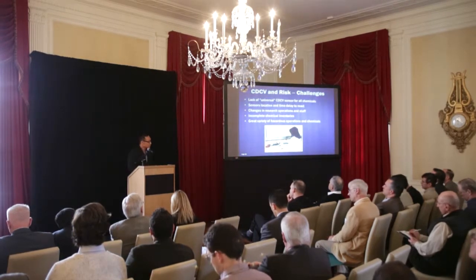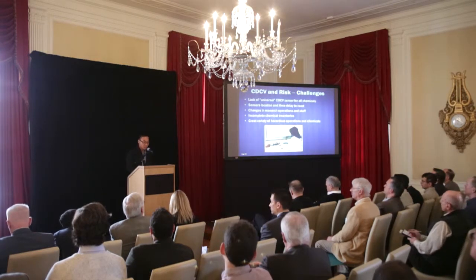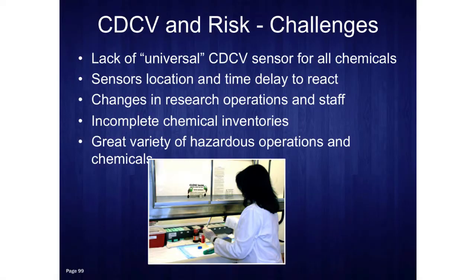So I think it's good to actually acknowledge what some of these shortcomings are. You know, a CDCV system is not a simple, you install it and everything in your lab environment is safe and everything is perfect, and it just provides a turnkey solution that you never have to worry about anything else. There are a lot of drawbacks, I guess.